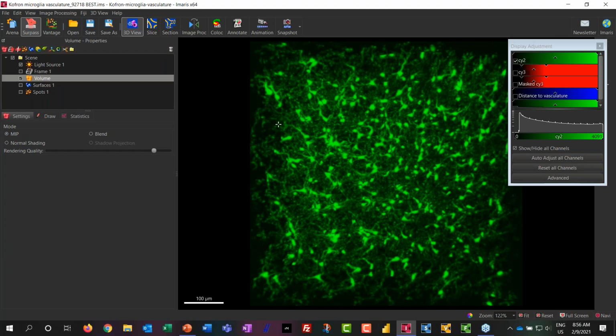I think it also might be important to mention that we actually compare with random distribution. And here in this model, I think the random distribution of spots is, let's say, easier or more simple to create as a comparison. But yes, right.